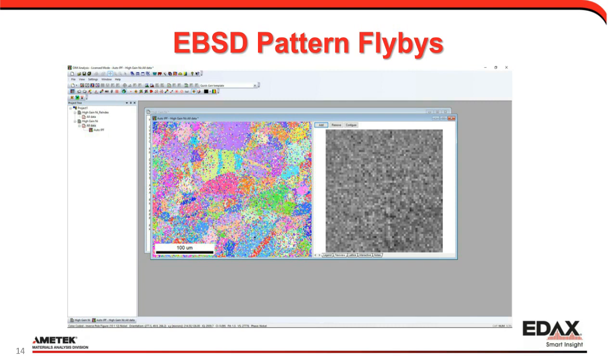The reason for doing this is to look at and understand the quality of these patterns, whether there are any spatial variations in these patterns, or any phase differences. If I can see phases, sometimes they act completely differently if I have different diffraction strengths. Again, it's to start to understand my data better and make sure everything is kosher. And with that, it's really about understanding what we're doing.